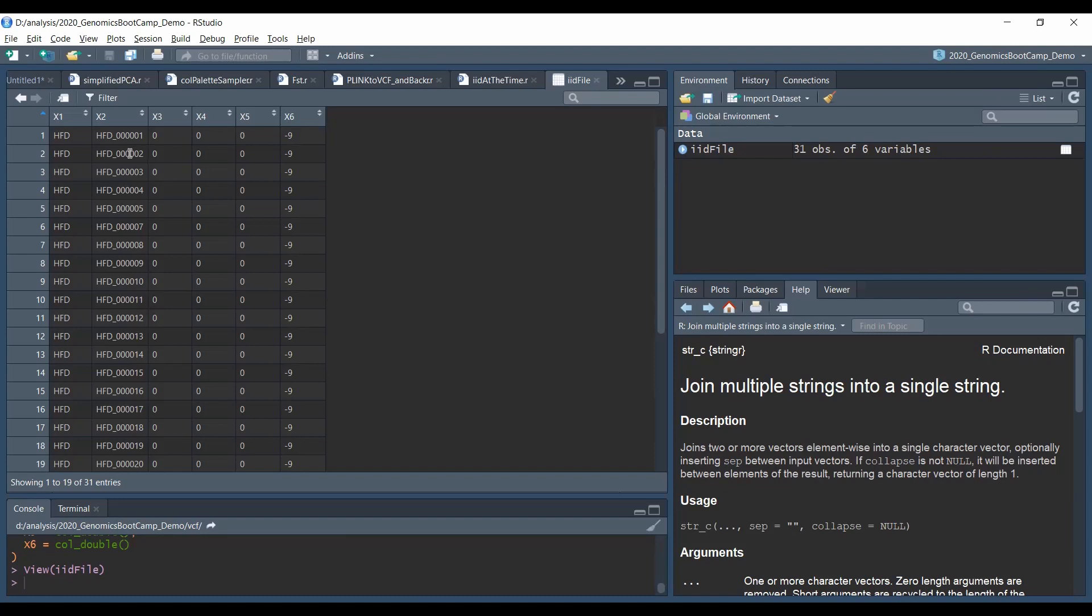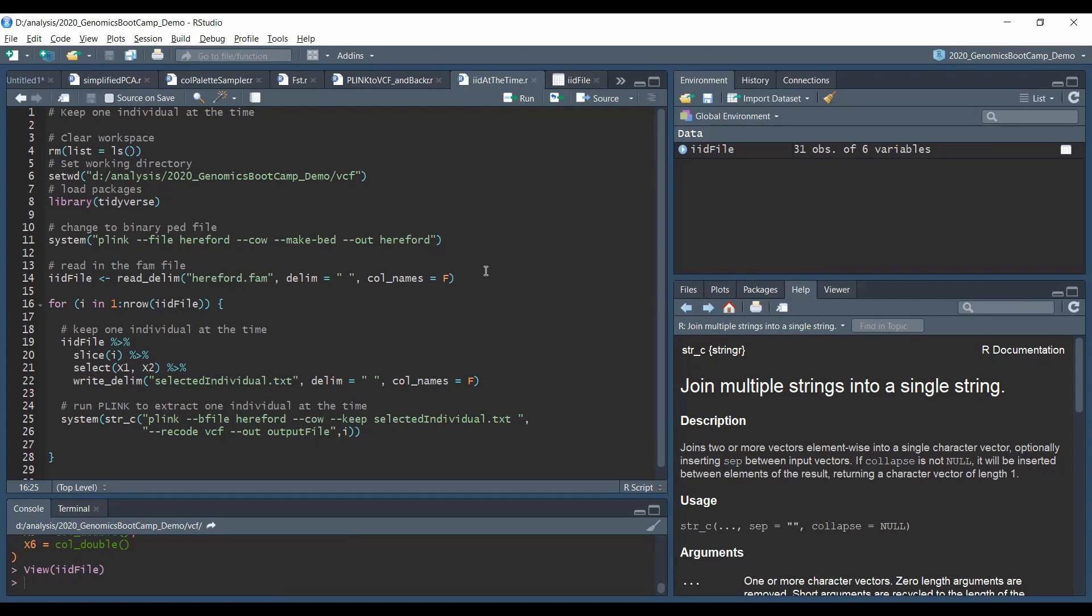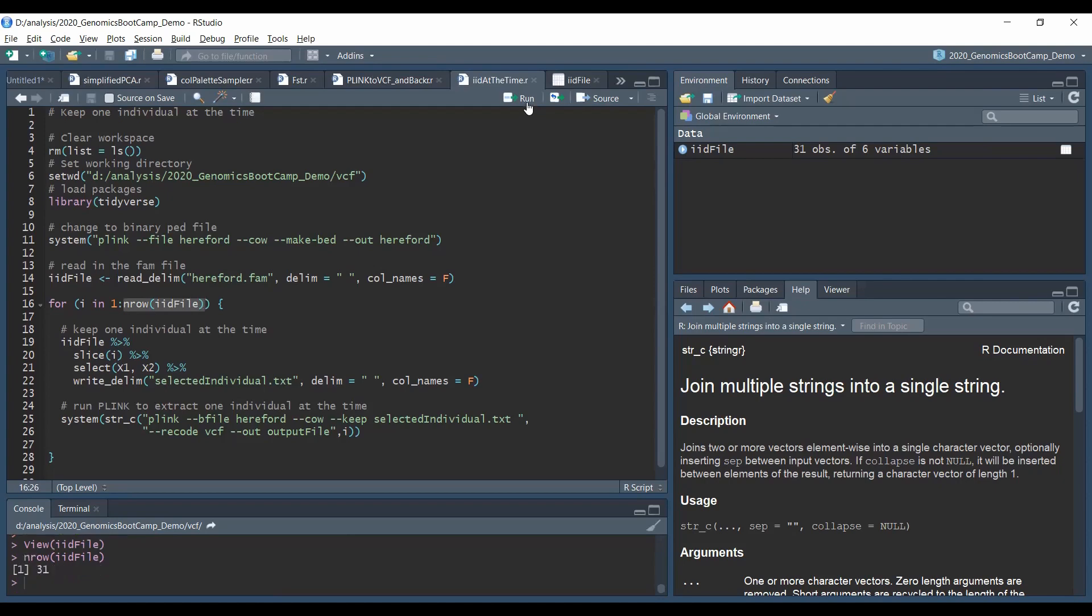The number of times this loop is run is indicated here. So it starts from one to the specific number. And to make these scripts very flexible, we do not hard code here that we want this loop to be performed 31 times, because this 31 times would fit for this particular dataset, but most likely it would not fit for the next dataset you want to use. So instead of that, there is this neat nrow function here, which actually computes the number of lines in the IID file. So this is certainly one, but if you will have a different dataset, it will compute the number of lines in your dataset.